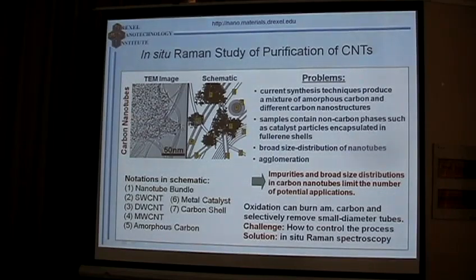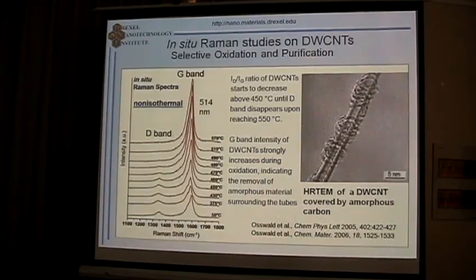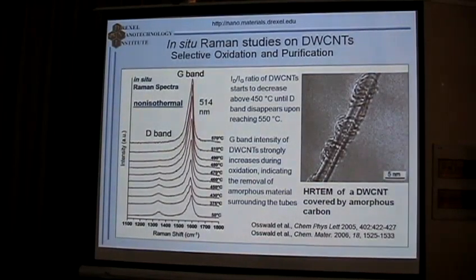One of my former PhD students showed that it's possible when, instead of just doing oxidation, taking a sample out, and studying it, you exactly monitor the process in the furnace by using Raman spectroscopy. He used a heated high-temperature stage under a Raman spectrometer and studied oxidation of nanotubes which were heated dynamically with a continuous heating rate, or statically step by step, with very high accuracy.